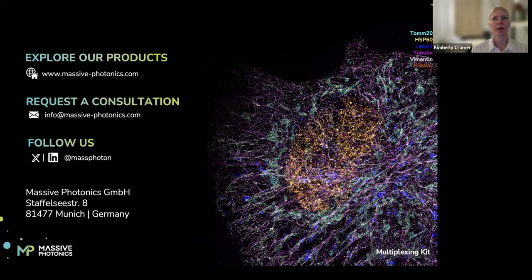The original qPAINT paper actually quantified this, and I believe it was around 95% accurate for counting the molecules in the cell. They calculated this using a protein with a known number of structures, so they could see it visually, and then they saw it with qPAINT also. So they really characterized how accurate it is for counting the molecules.